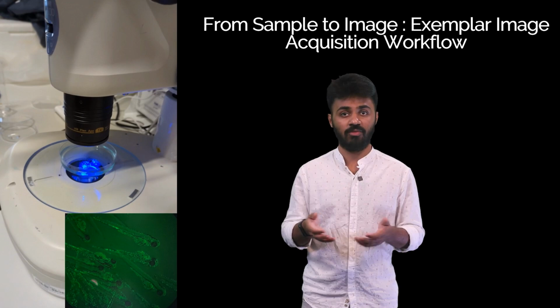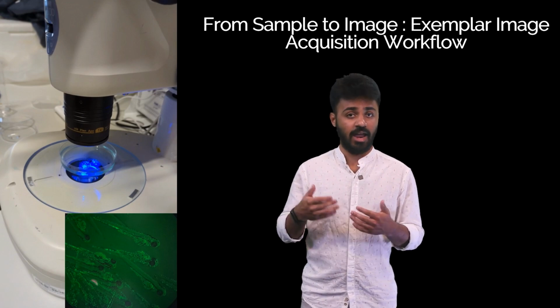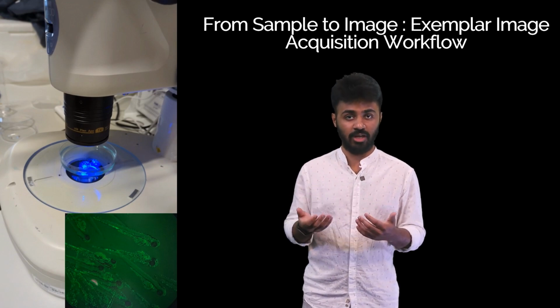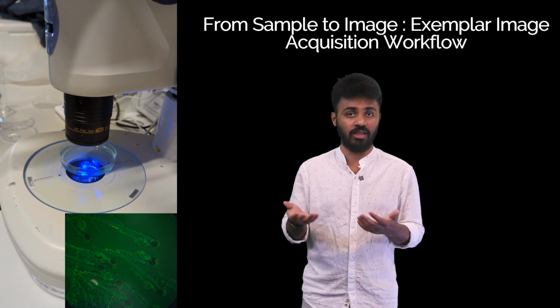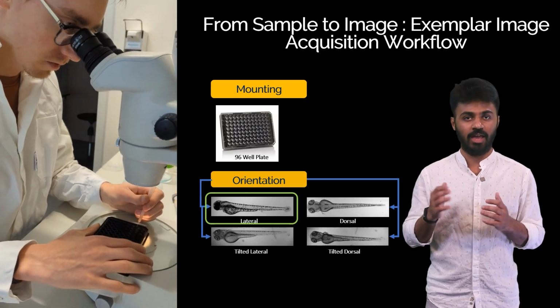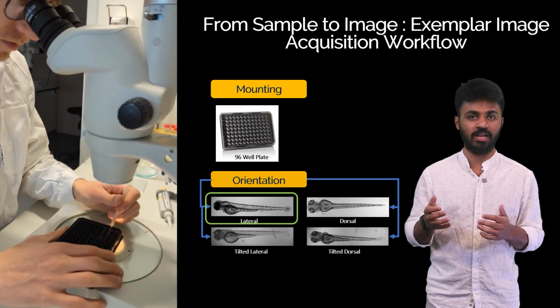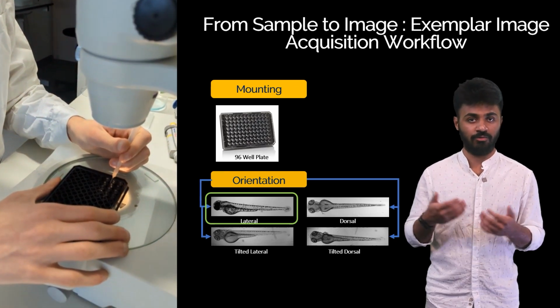For this experiment, we loaded the embryos onto a 96-well plate with agarose grooves to maintain their position over time. Once they are loaded, the embryos need to be oriented correctly according to the experimental requirements, which in this case involve lateral orientation. Post-mounting the embryos, the 96-well plate was sealed to prevent any potential evaporation of the media during the course of imaging.